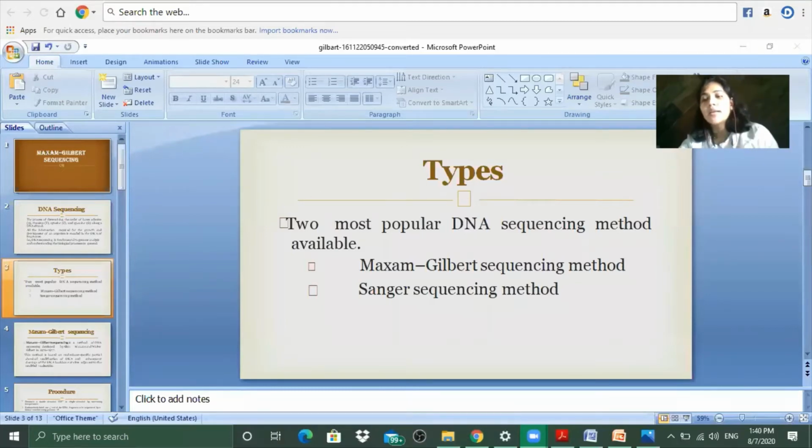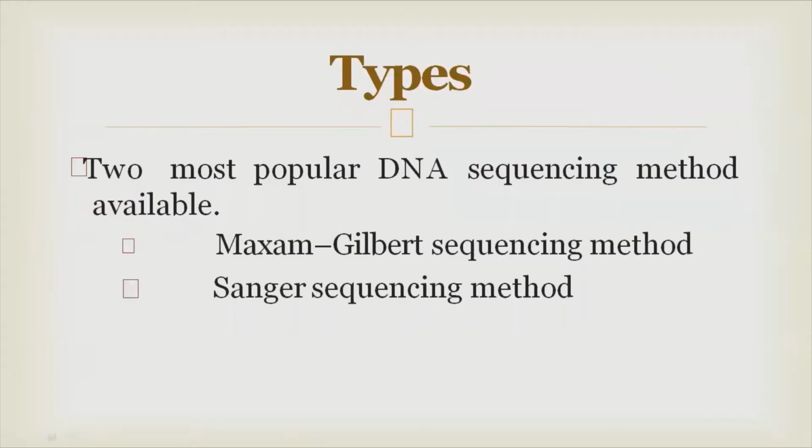Okay, so yeah, in Sanger sequencing, he used dideoxynucleotide base pairs, and then accordingly he sequenced the DNA. Then the DNA fragments from each reaction tube he ran onto a gel electrophoresis, and he counted the fragments from lower molecular weight to higher molecular weight. So overlapping sequences were there, and then accordingly he could decode each and every nucleotide on the DNA template that we are willing to sequence.